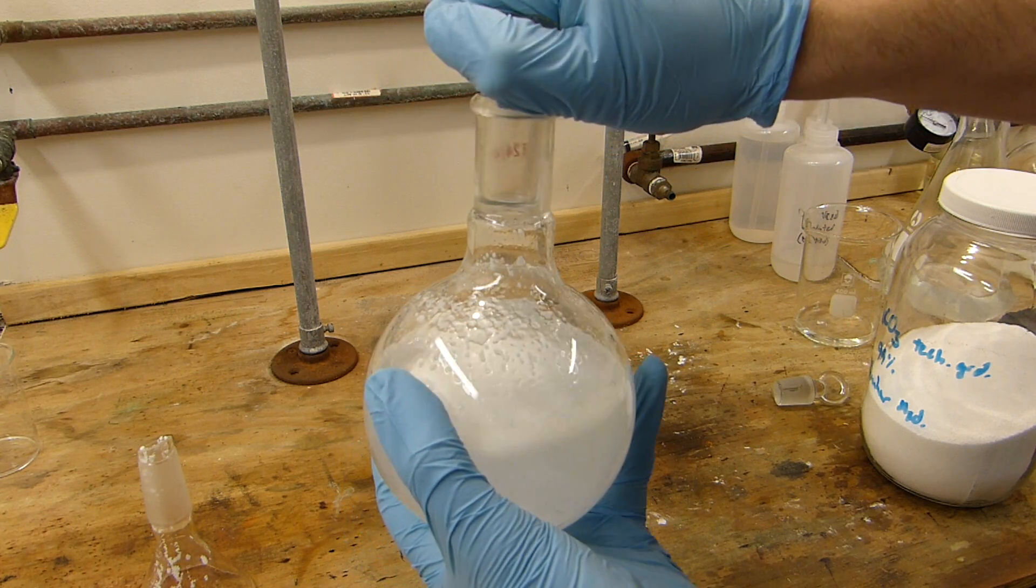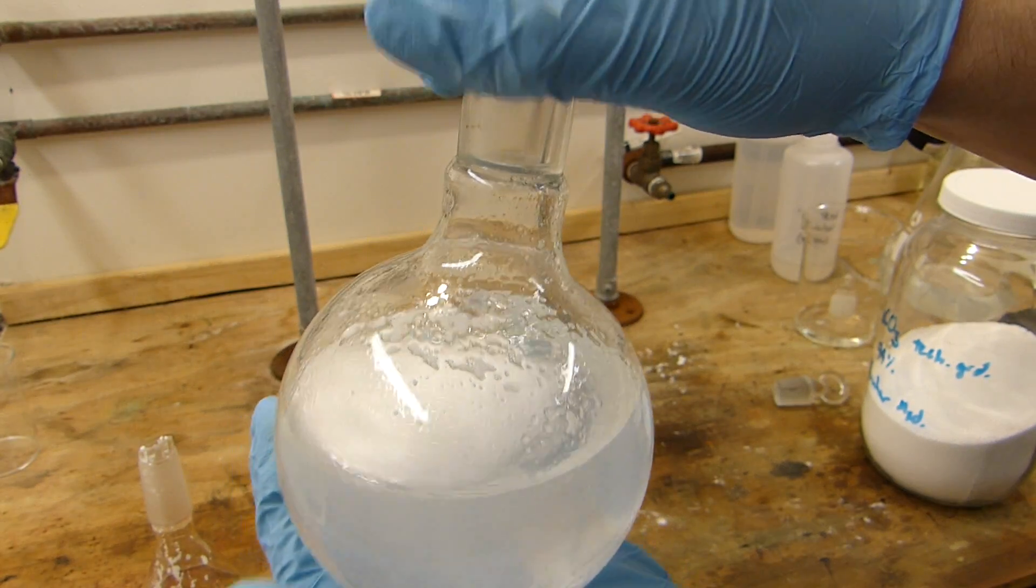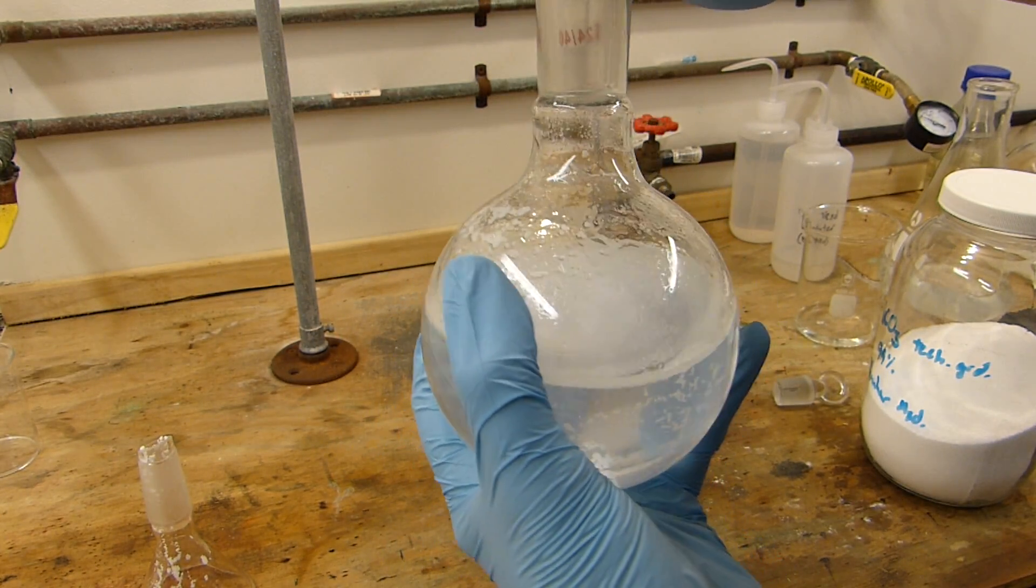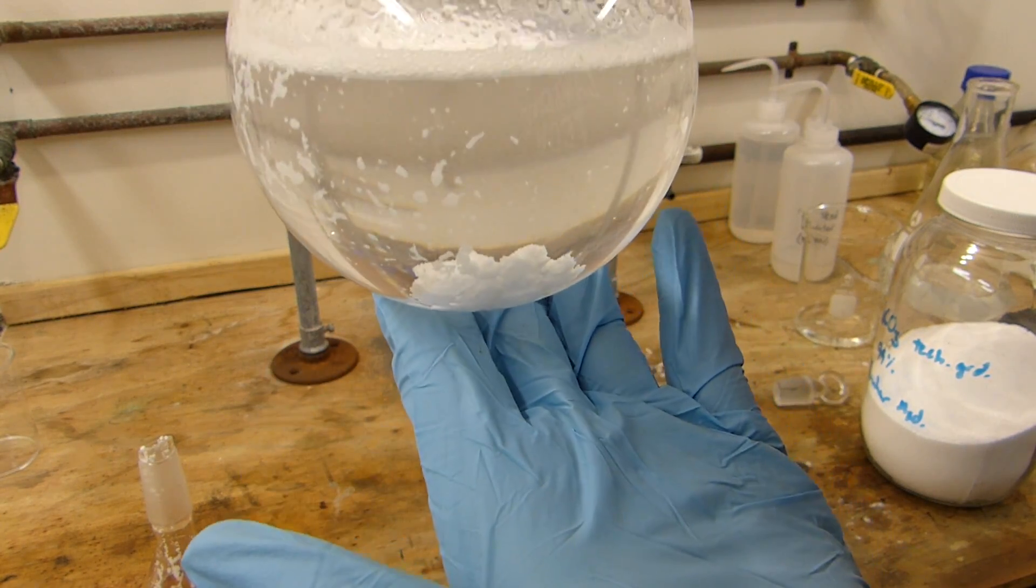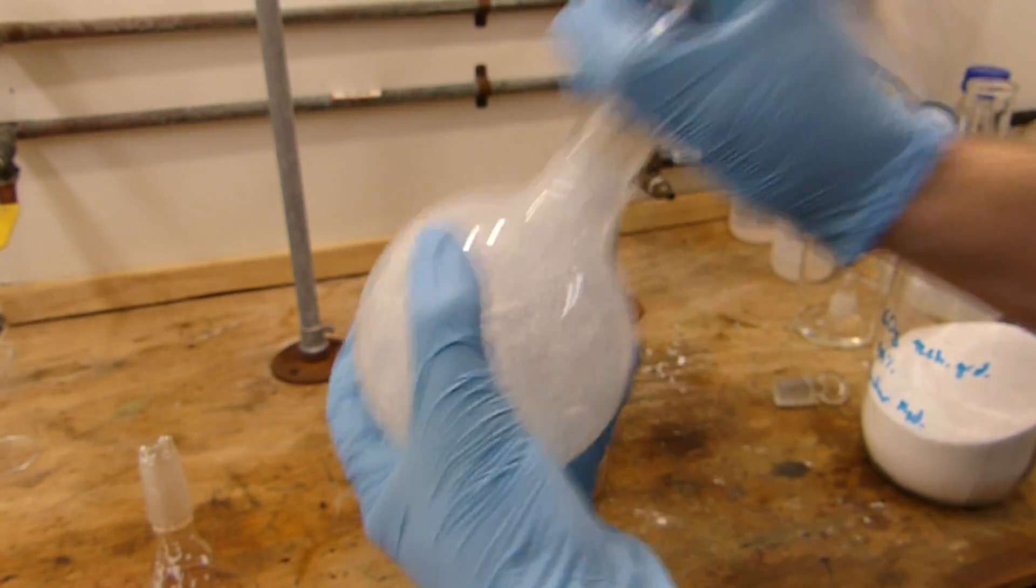Get the potassium carbonate mixed in and you can see it sort of clumps up in the presence of water, but we are very quickly removing the water from this dichloromethane as you can see it's becoming quite clear.